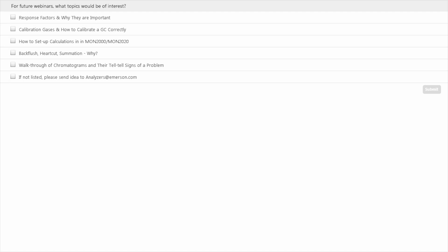So when you're designing a sample system, you need to design not for the normal condition, not for the standard condition. You should be designing for the worst possible condition. When maybe the separators are not working anymore, or something's happened in the process, and you're now getting a heavier sample than what you expect in a vapor, you need to plan for that, because you don't want that contamination getting into the GC.